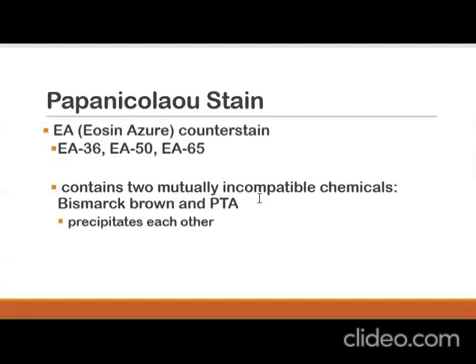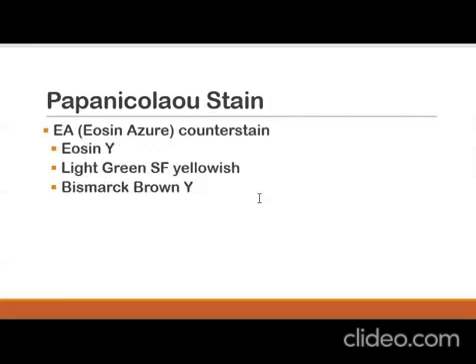So you will notice later, when we arrive at Bismarck brown, I will say that Bismarck brown is usually not included in the formulation of Eosin Azure. And you will know another reason later. Okay? So let's discuss now each of the dyes under your Eosin Azure counterstain.